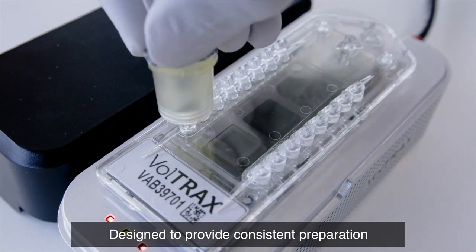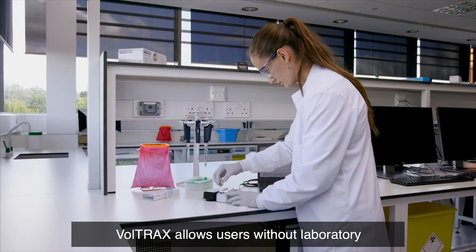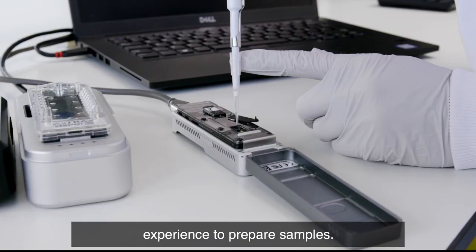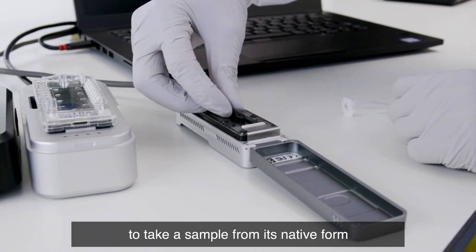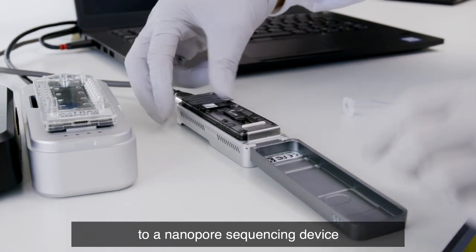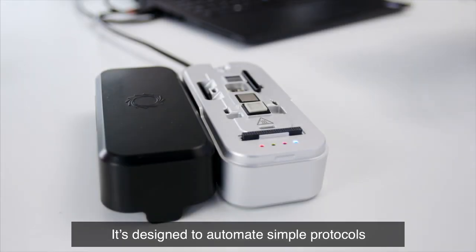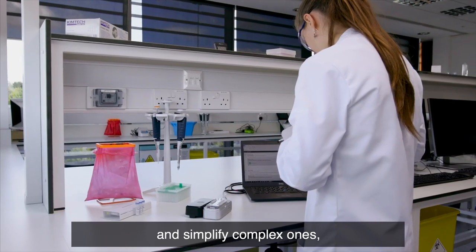Designed to provide consistent preparation for the most reliable results, Voltrax allows users without laboratory experience to prepare samples. With Voltrax, it's possible to take a sample from its native form to one ready for application to a nanopore sequencing device with minimal need for human intervention. It's designed to automate simple protocols and simplify complex ones.